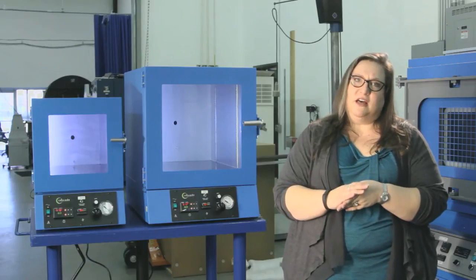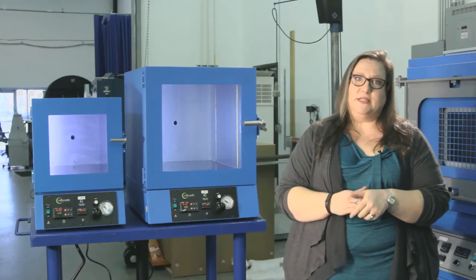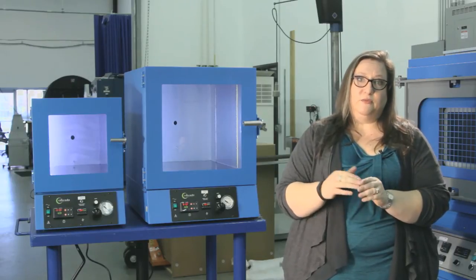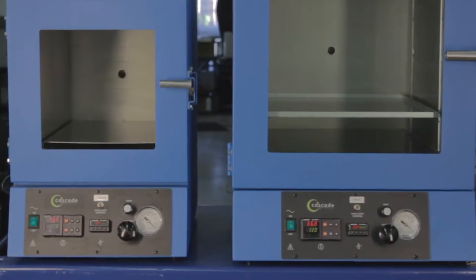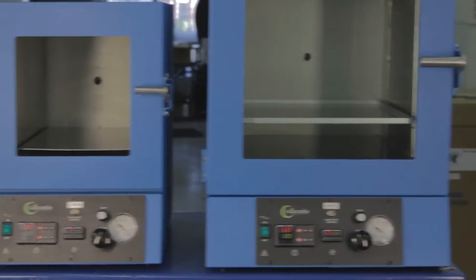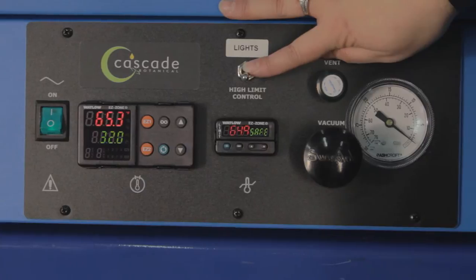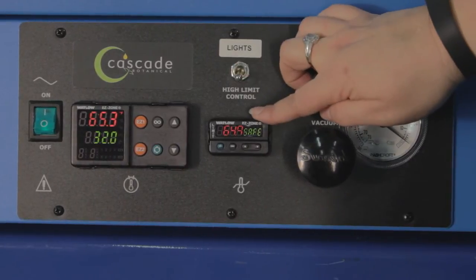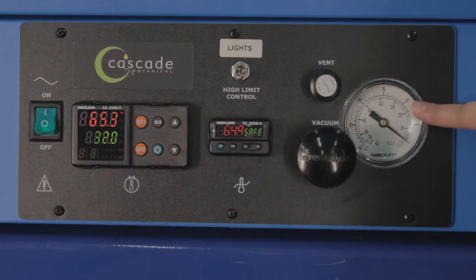The controller provides a lot of information to the user: the current temperature in the oven, the set point, as well as a pilot light that will inform you as to whether or not the heaters are being activated. The control panel of both the TVO2 and TVO5 vacuum ovens are identical: light-on switch, main temperature controller, door light switch, over-temperature protection, vent valve, vacuum valve, and gauge.